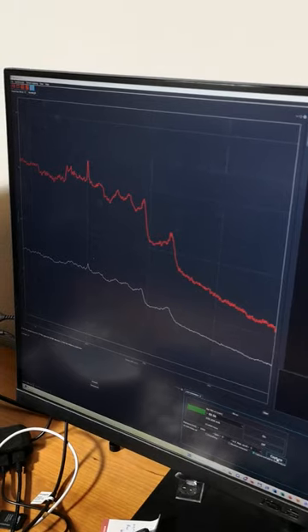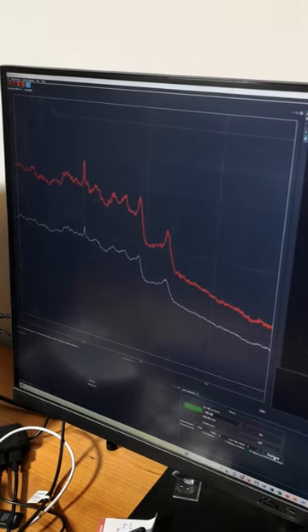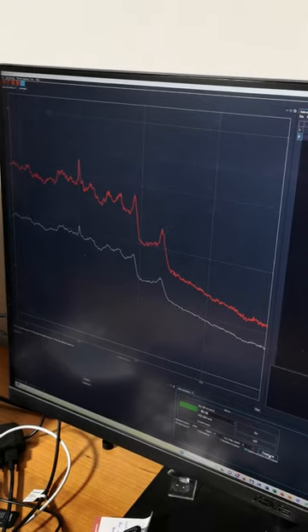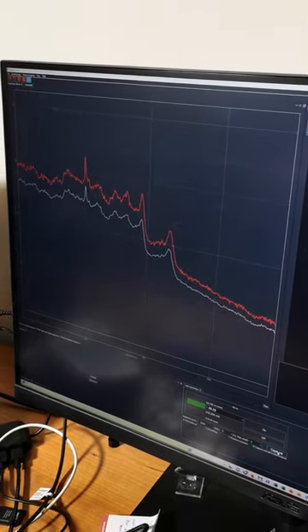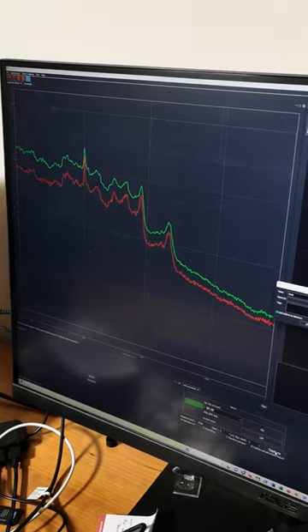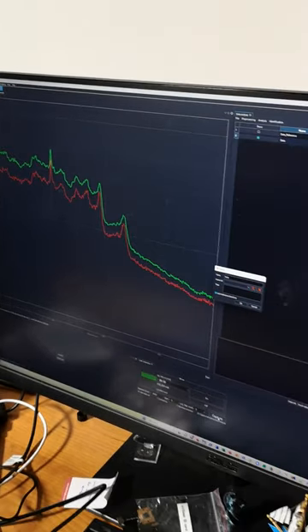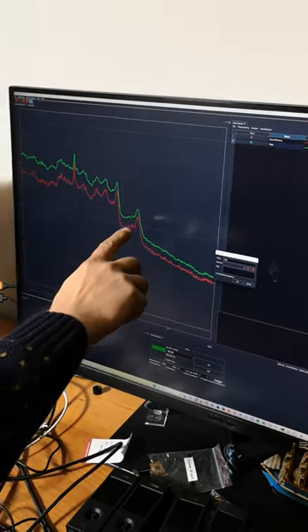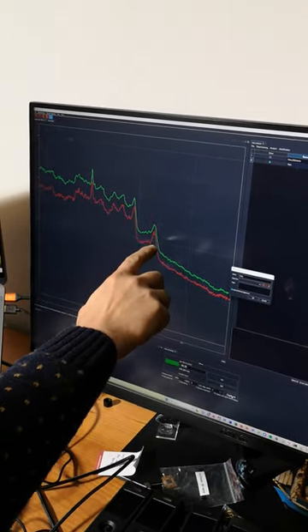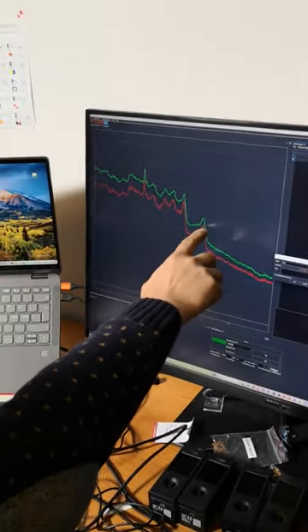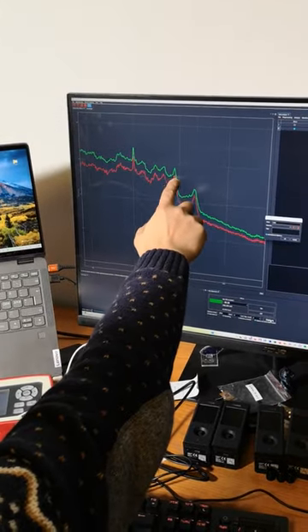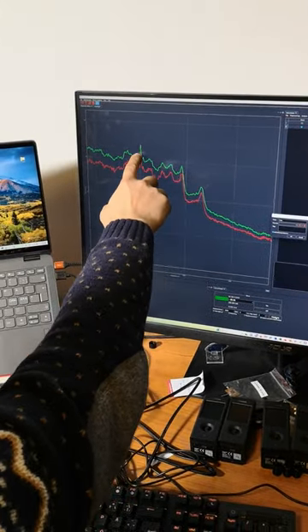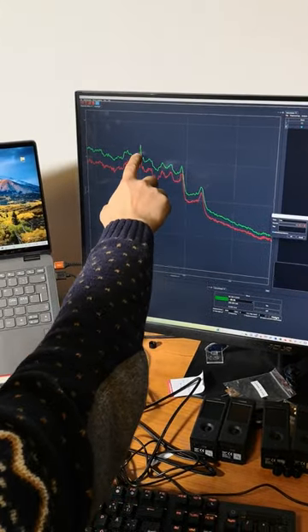The signal is being integrated, and we can see some features — such as typical features of proteins and bacteria: amide-1, CH-bending, and the phenylalanine peak.